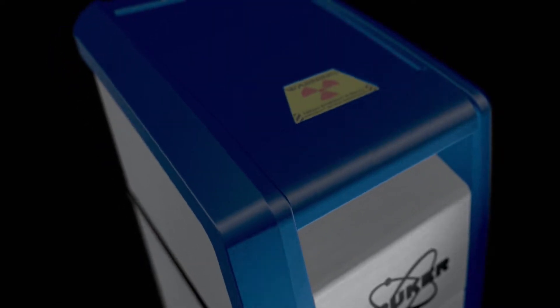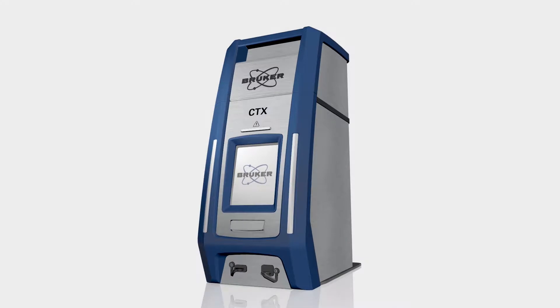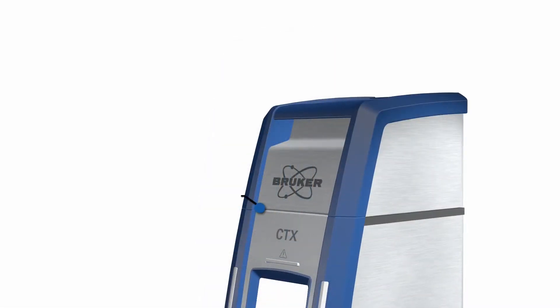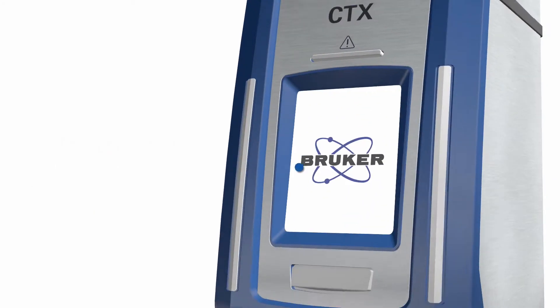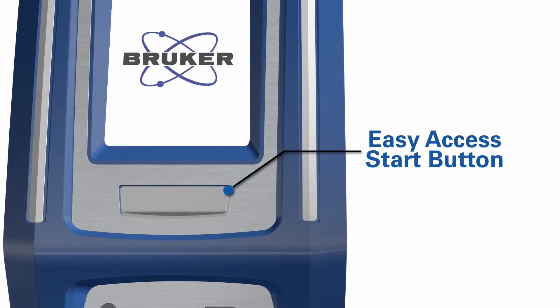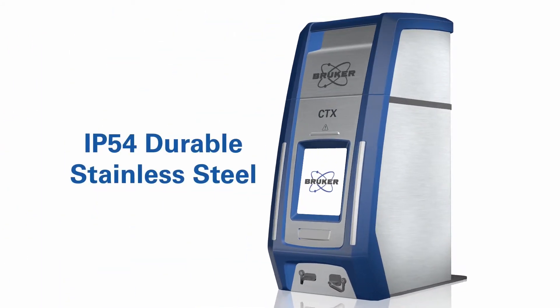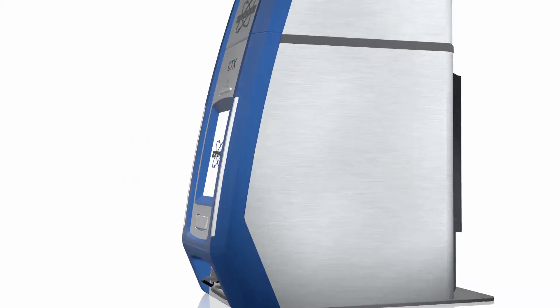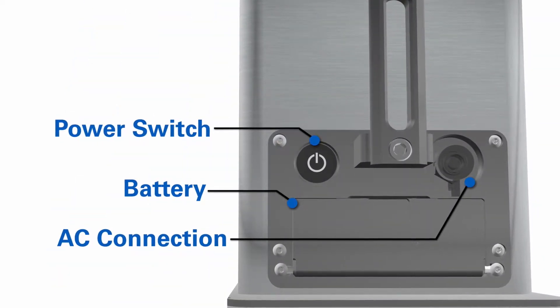Bruker introduces the new CTX, a portable, lightweight, small footprint, self-contained, battery-operated, and safety-interlocked countertop XRF elemental analyzer. The CTX has a double safety-interlocked sample compartment, a touchscreen user interface, and an easy-access start button, all encased in IP54-sealed durable stainless steel.